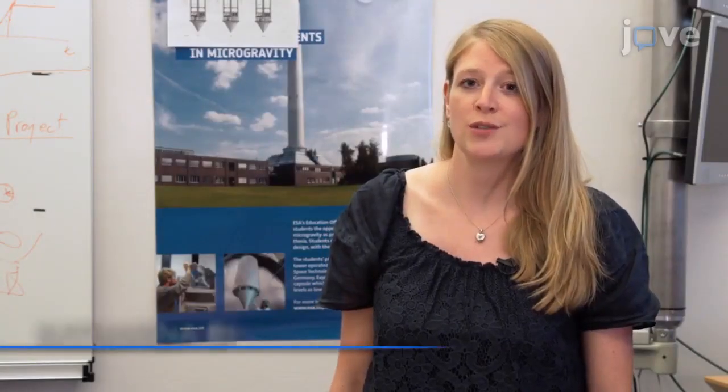This protocol includes a step-by-step procedure for constructing nanostructured photoelectrodes for efficient light-assisted hydrogen production in microgravity environments. It also includes an electrotesting procedure for testing these photoelectrodes at the Bremen drop tower, where 10^-6 g can be generated in 9.2 seconds of free fall.